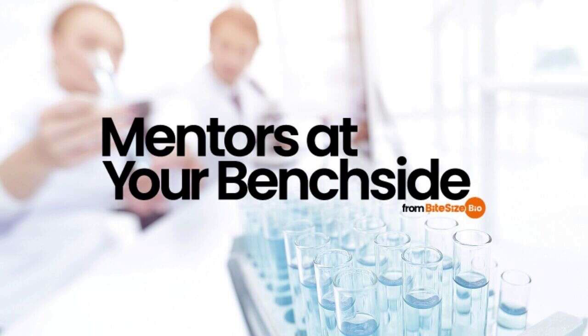Set the following parameters: PCR product size. For efficient amplification, design the primers so that the amplicon is between 70 and 200 base pairs long. Number of primers to return. This is up to you depending on how many options you want to choose from. It won't take long for the program to design 10 primers, and this should give you a reasonable chance of finding a suitable pair. Melting temperature.